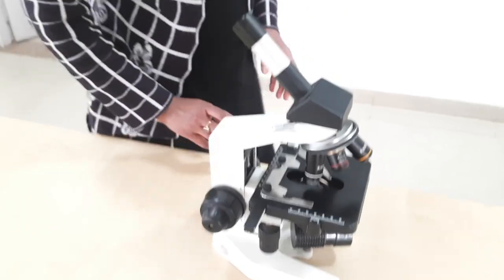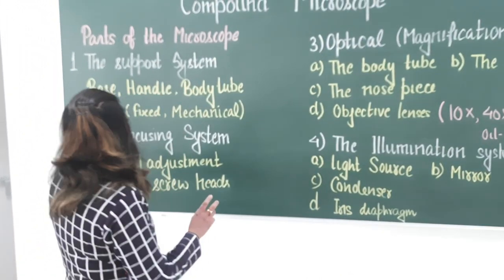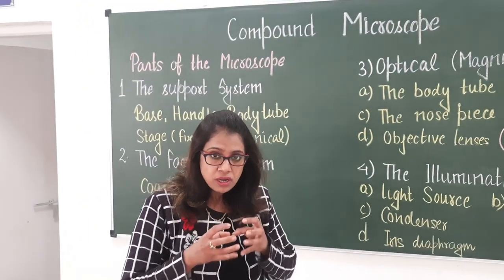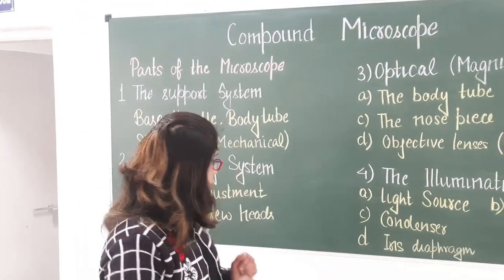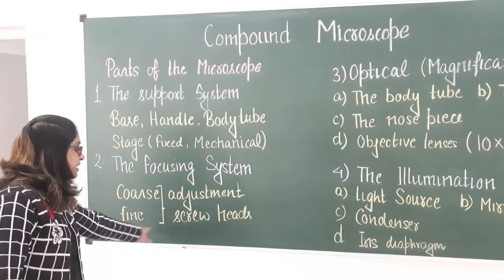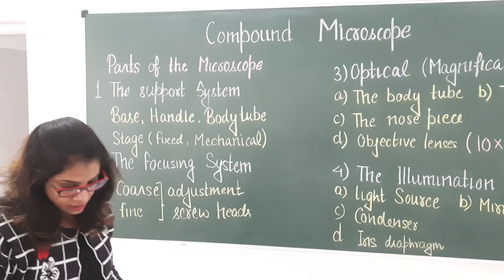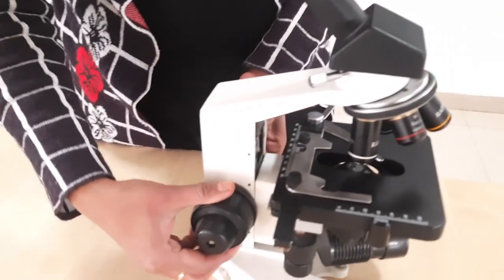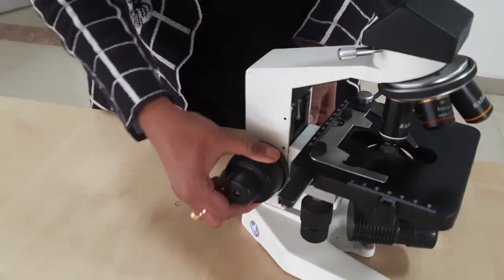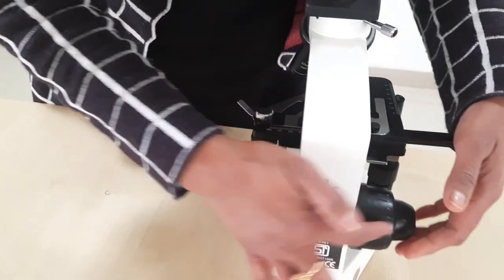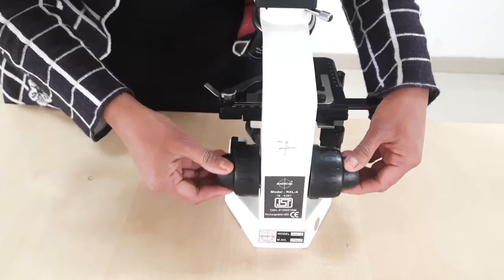The second system is the focusing system, which is used to focus the specimen. It consists of coarse and fine adjustment screw heads. You can see on both sides of the microscope there are coarse screw heads, and the smaller ones are the fine screw heads.